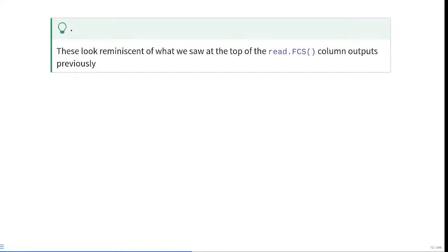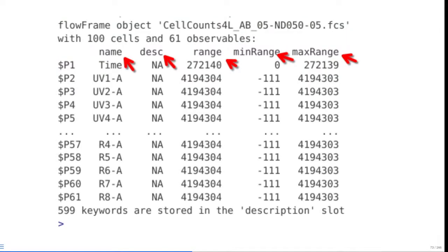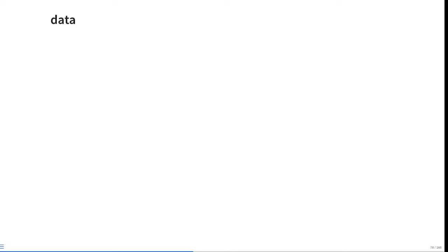Basically, it's like a matrix object, but it also has the ability to encode actual character values, column names, row names, a bunch of things that the matrix, which is a little bit simpler, would not be able to show. So, as we mentioned, the names of those particular objects we got back for var data look kind of similar to what we were seeing within that initial read output. But let's go ahead and take another look at the data object directly below.